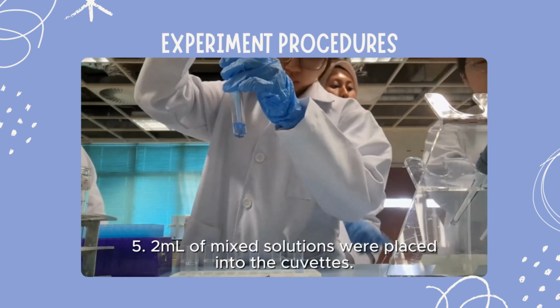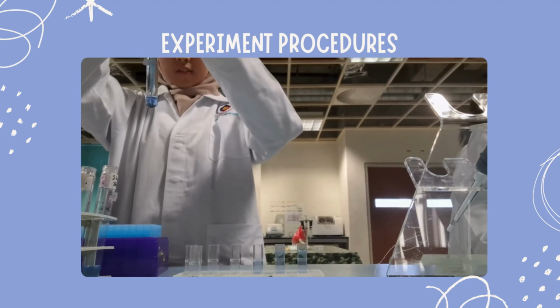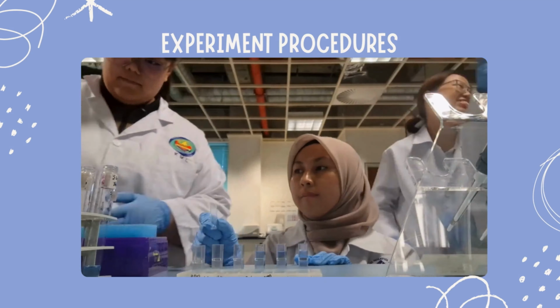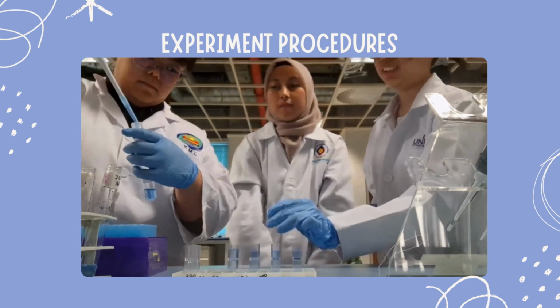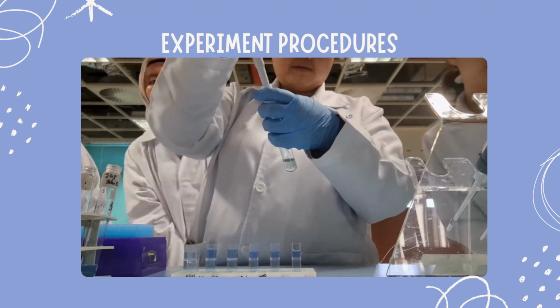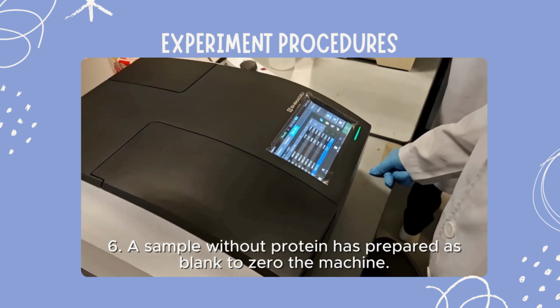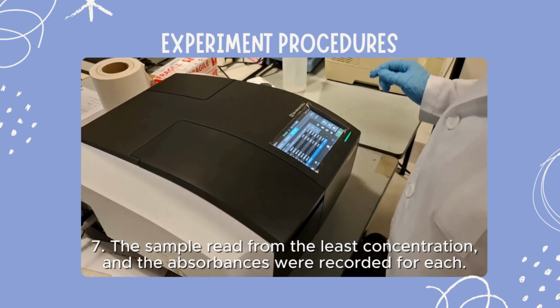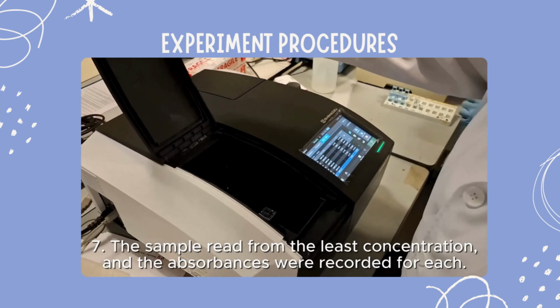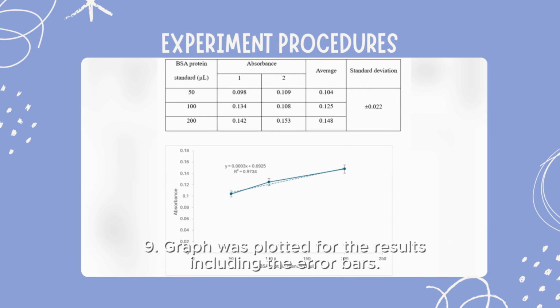Two ml of the mixed solution were placed into the cuvettes. A sample without protein was prepared as a blank to zero the machine. The samples were read from the lowest concentration, and the absorbance was recorded for each. Average and standard deviation for each point were calculated. A graph was plotted for the results, including the error bars.